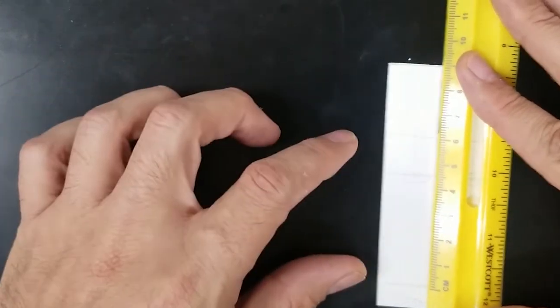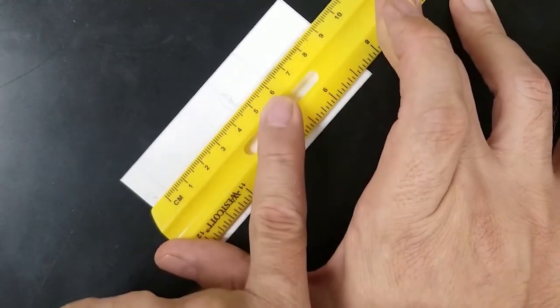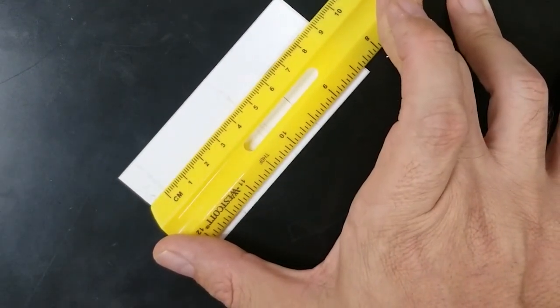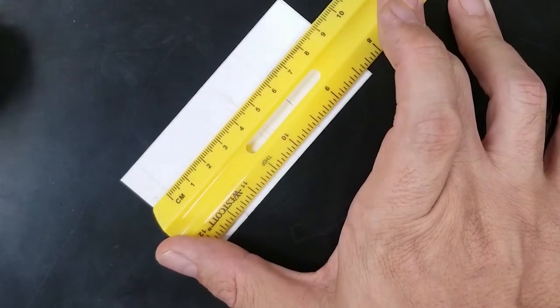Let me fix the lighting there a little bit. Yep, hopefully the lighting is showing up okay. Looks to be about 6 here. Sorry, a little bit over. Let me fix that where it's at again. There we go. Yeah, about 6.1. And then the one for salicylamide looks to me to be a little over 4.5.